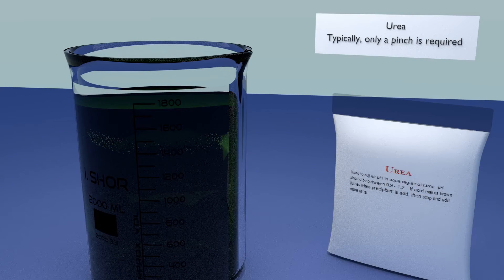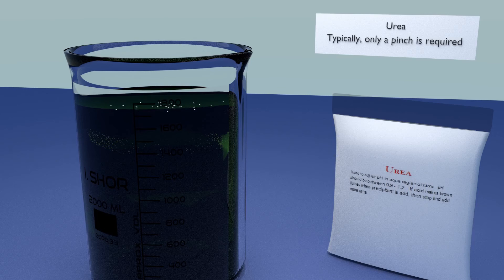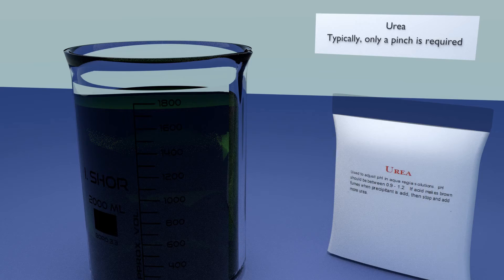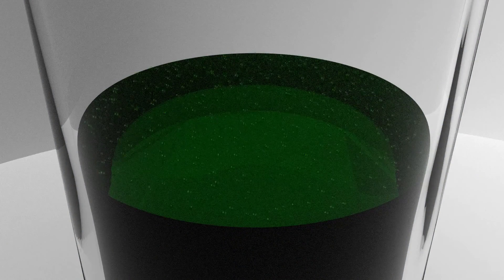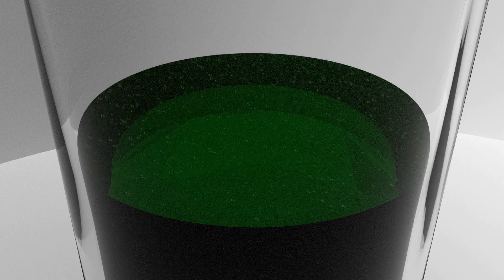Add a pinch of urea. If your ratios of metal, acid, and MX3 were correct, there will be no reaction. However, if the urea fizzes, then slowly add more until there is no reaction.